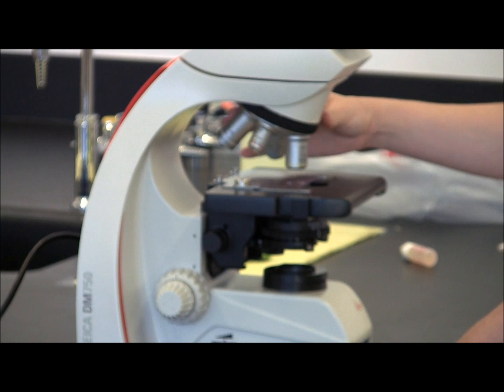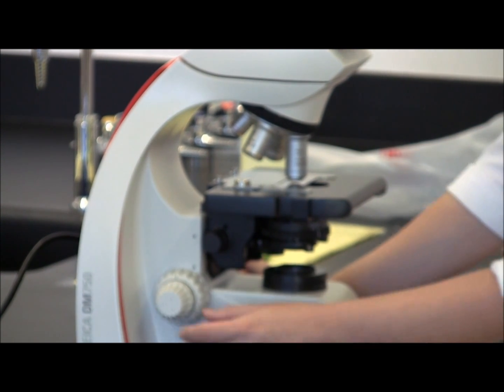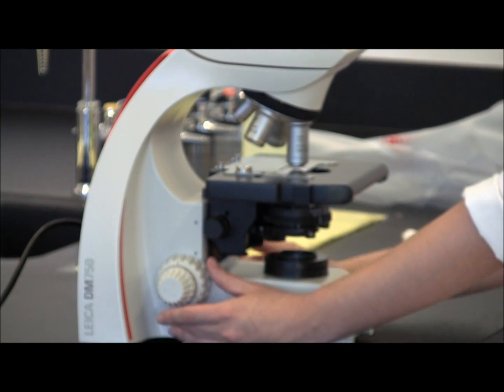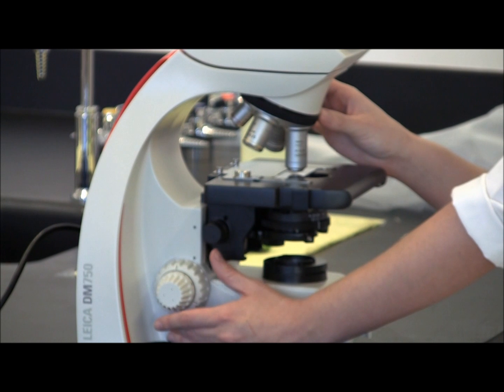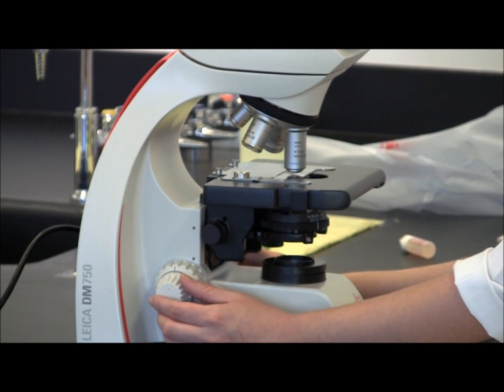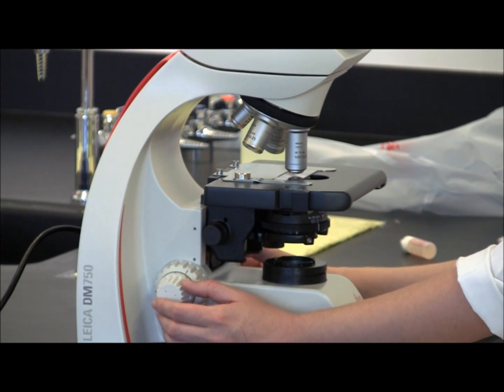Once you have that in focus, you can move to the 40x objective. Here, you want to start using the fine focus. You should never use the coarse adjustment knob on the 40x objective or the 100x oil immersion lens. So using your fine focus, you should be able to bring the specimen back into focus and make it as clear as possible.